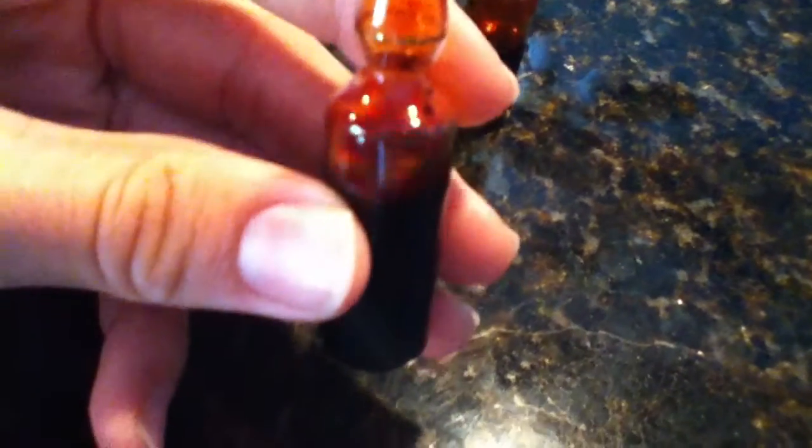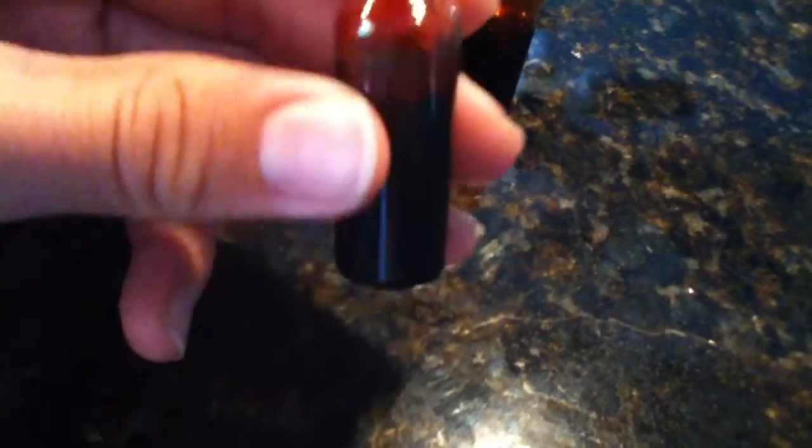I used quite a bit of sodium bromide though — about 200 some grams, I think 218 grams. So I lost quite a bit of bromine but I got quite a lot too.